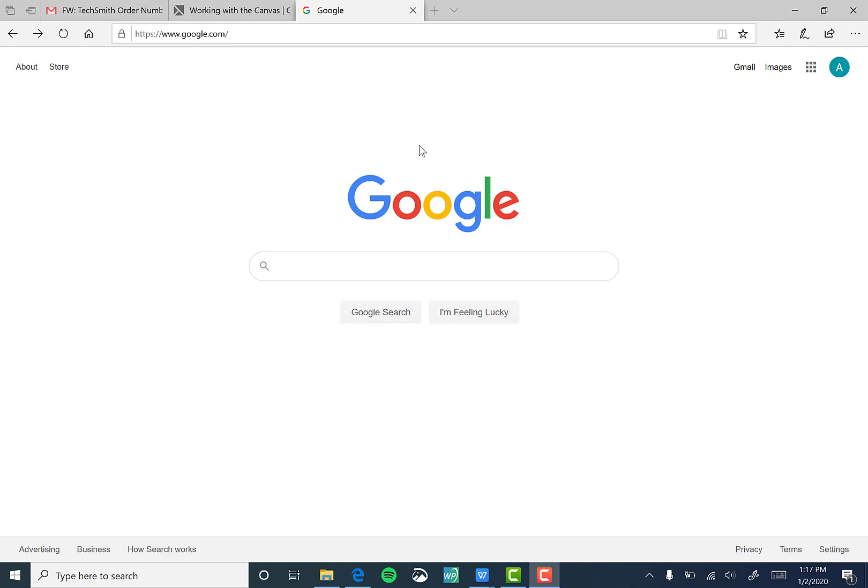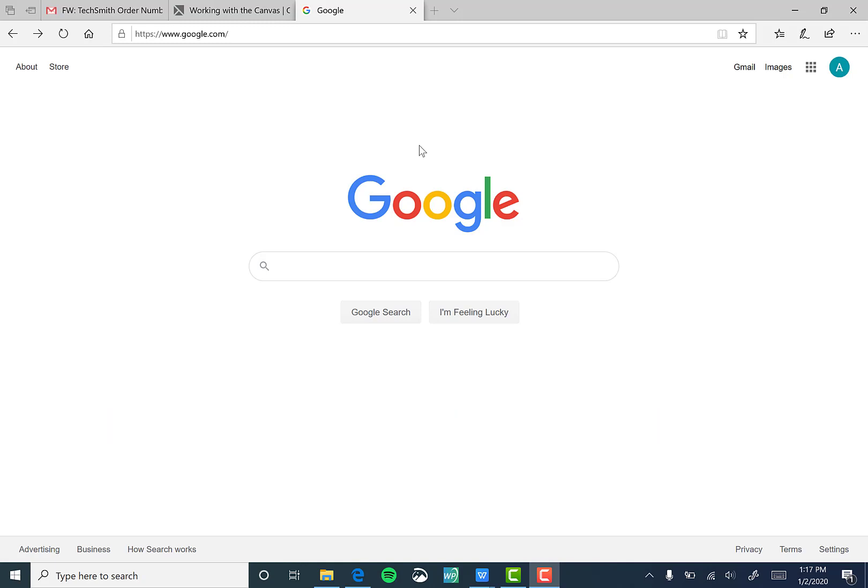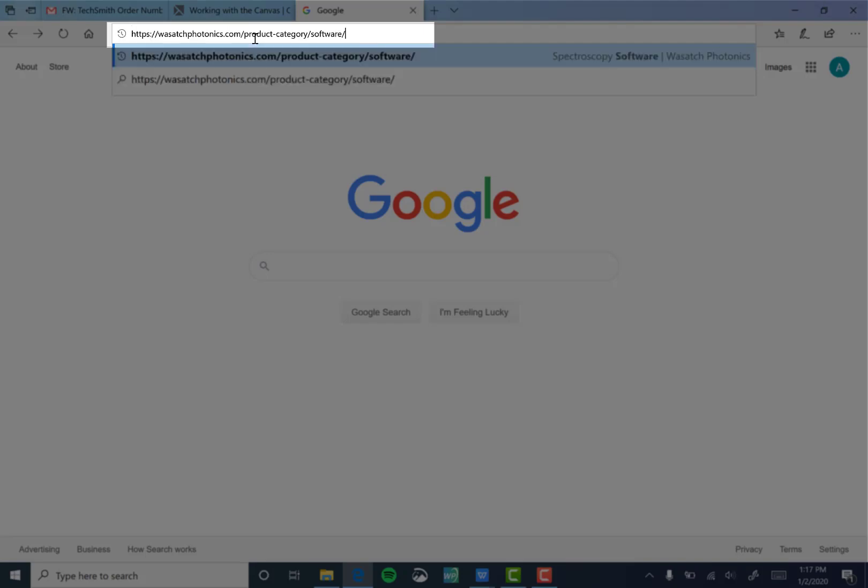If you're following along with the product manual, go ahead and jump to section 2 called Installation. We're going to start by launching a web browser. I'm using Internet Explorer. Go ahead and copy and paste the first URL listed below section 2.2 in the manual entitled Download.